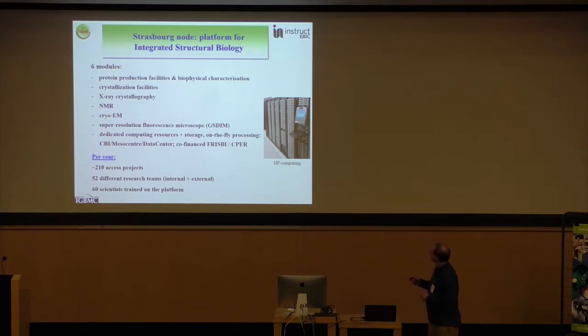And so now to come to the center here, there are 6 modules run throughout the platform. So you see it's not only CryoEM, even though we're doing a workshop on CryoEM, but it's very important, this link, this synergy between the various modules. So protein production facilities, biophysical characterization, crystallization facilities, Xray crystallography, including native phasing, NMR, CryoEM, single particle, but also tomography.